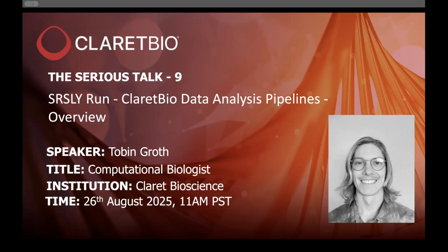Yeah, I'm very happy to be giving this talk. As Varsha mentioned, my name is Tobin. I'm a computational biologist here at Claret, and I have helped build this software as well as some of the other software available from Claret Bio. In this talk today, we're going to mainly focus on a general overview of Seriously Run. As Varsha mentioned, we'll be talking about installation, how to run, and ultimately what the pipeline will be outputting, which will be what is in your hands after you run this pipeline.